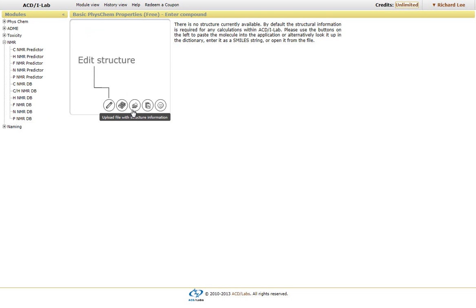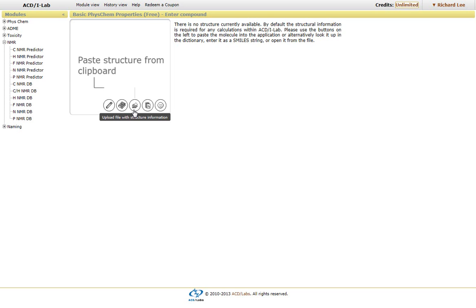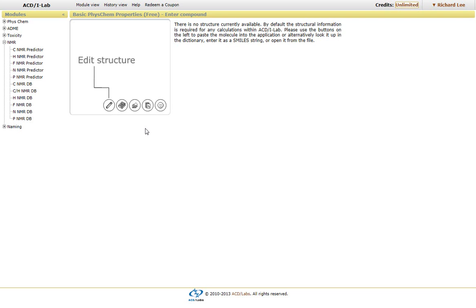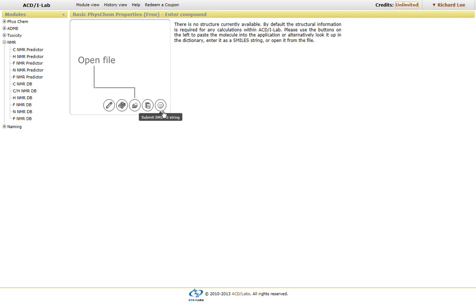You can upload the structure, whether it's a mole file or a ChemSketch or a ChemDraw file or ICIS file. You can copy and paste from another drawing package or enter in the SMILES notation.